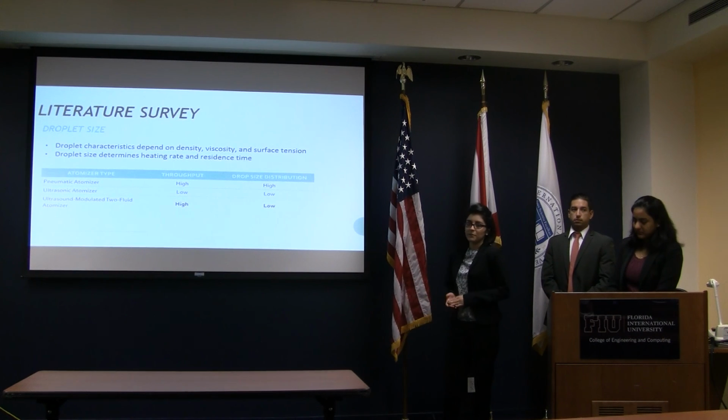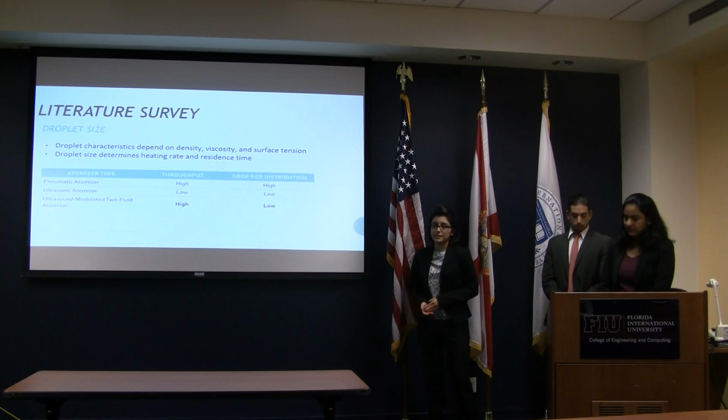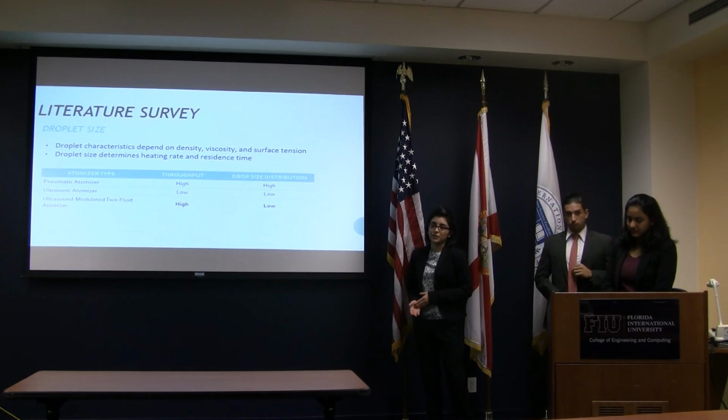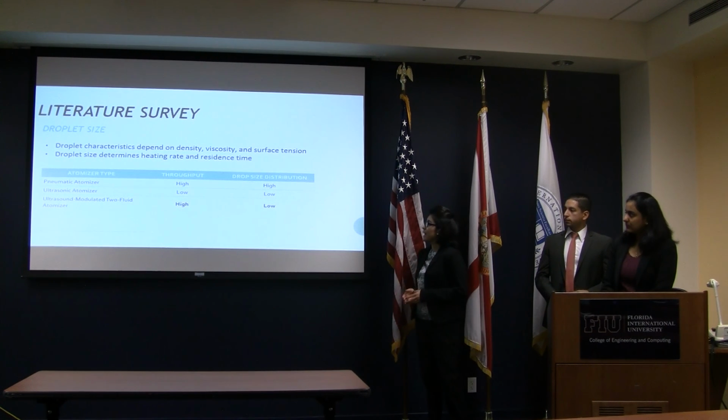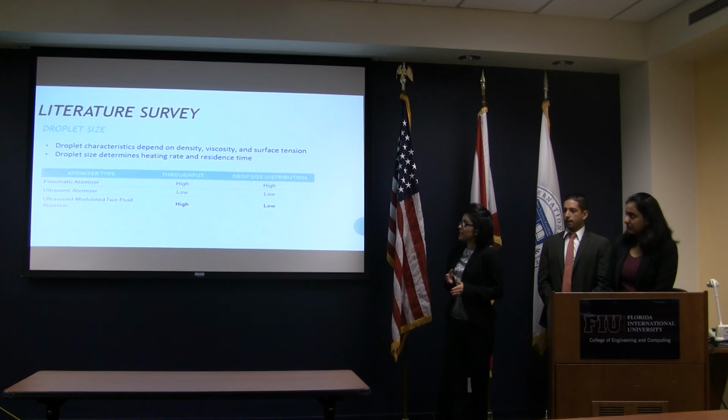In a past experiment, 3 atomizing techniques were tested in order to define whether there was a relationship between the precursor droplets and the powder particles. As it can be observed, the ultrasound modulated 2-fluid atomizer had the best results. It produces a high throughput and a low drop size distribution. This shows that we can obtain a controllable and effective system.